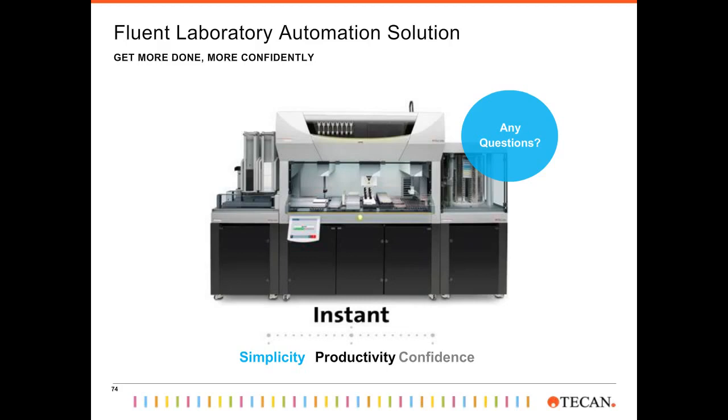And here's another one. Are there problems with putting surfactants into the stock solution? So this is probably from a person concerned about cell-based assays. What we found is that it depends on the cell type which surfactant you use. However, as there is only 0.1% of surfactant needed in the stock solution, and we are distributing very low volumes into the assay plate, the concentration in the assay plate is somewhere below 0.001%. However, if you are working with a cell-based assay, we'd encourage you to try out different surfactants and do a titration just with the surfactant to see whether your cells react to it, but so far we haven't seen any problems with that. Great, thank you so much.